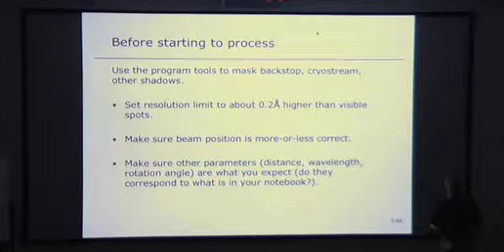It's really hard to do that when you've just got a list of reflections to work with and you haven't got images to see where the bad regions are. When I'm processing data, I always set the resolution limit to about 0.2 angstroms further out than I can actually see spots, which is very often useful information there. Increasing that limit a little bit will not disturb the integration. The refinement won't go badly because you've got a little bit of extra information there.